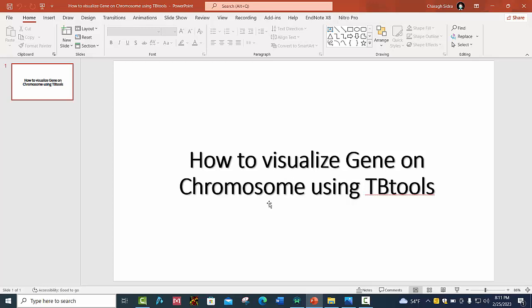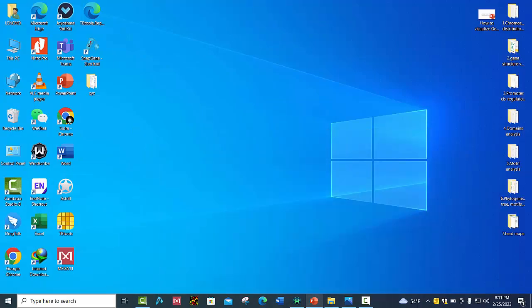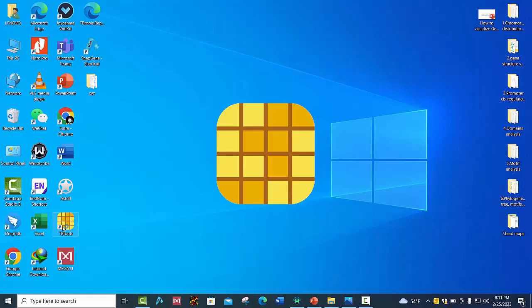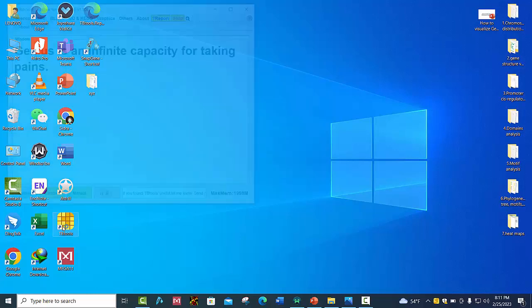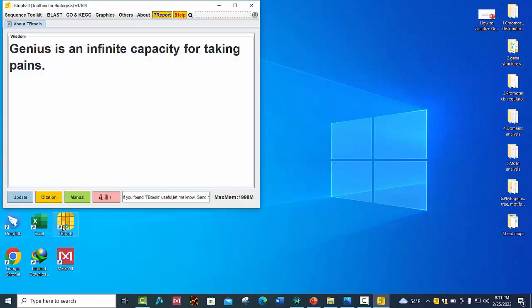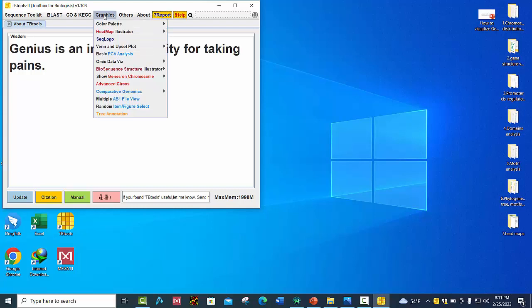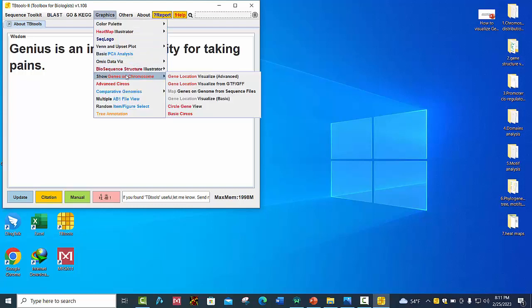We will see how to map our genes on chromosomes using TB Tools. Open your TB Tools software, then go to Graphics, click on 'Show Genes on Chromosomes', and open the gene location from GFF or GTF files.